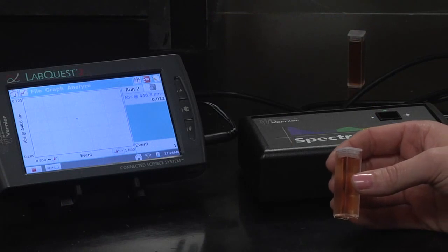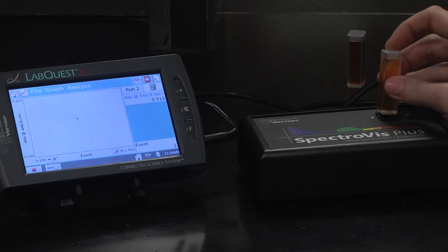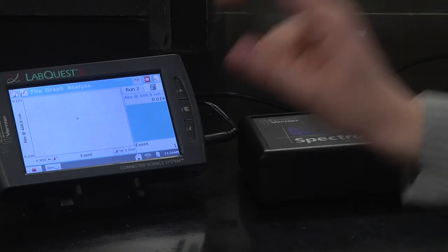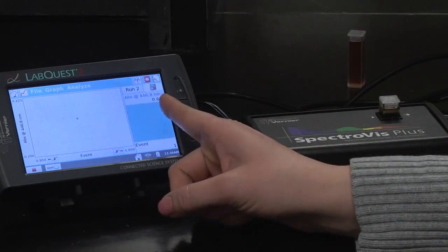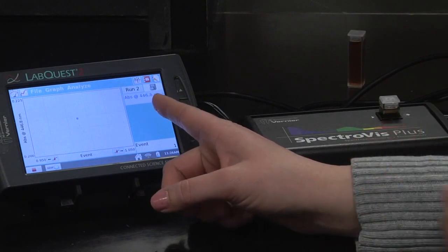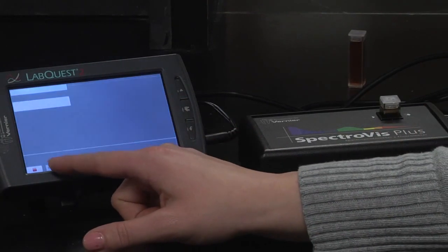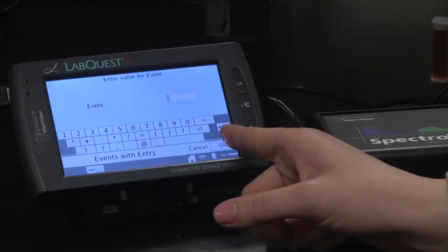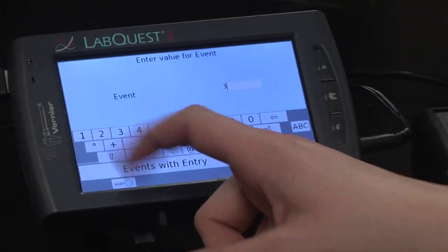Now that we have started our data collection, I made another cuvette for beaker number three. Notice how it changes from 0.9 to 0.6, and now I can press keep and it'll say beaker number three.